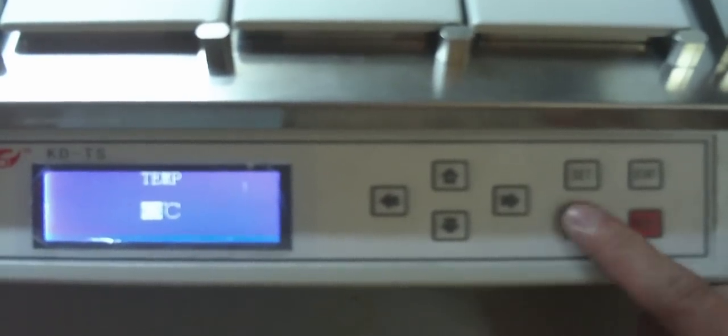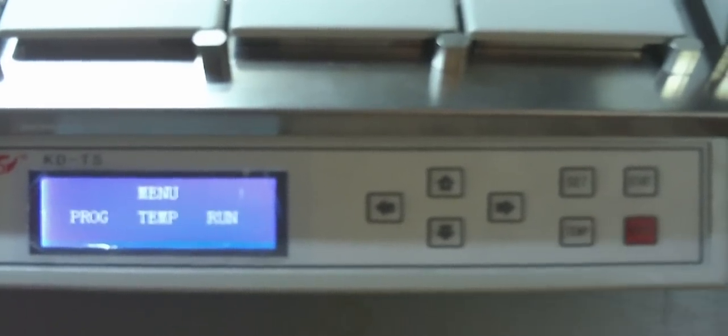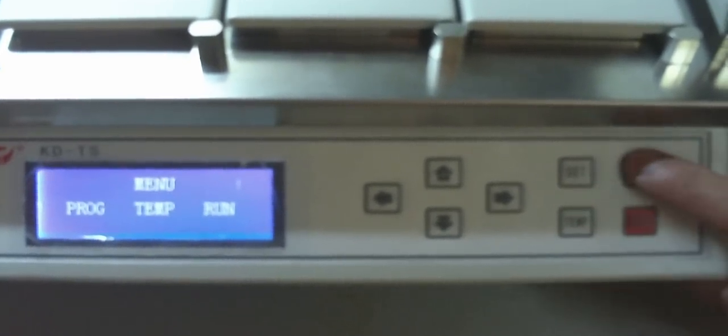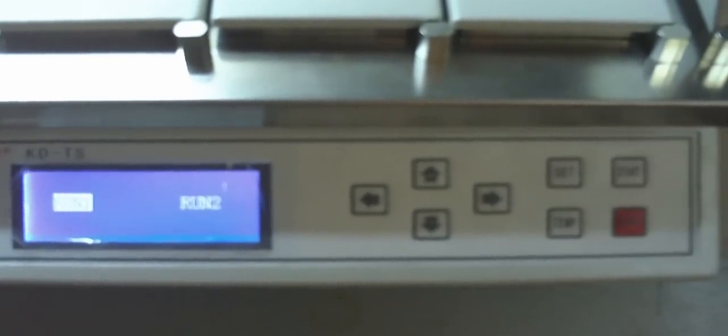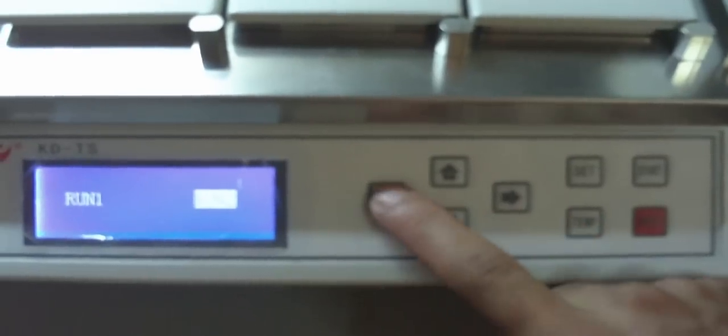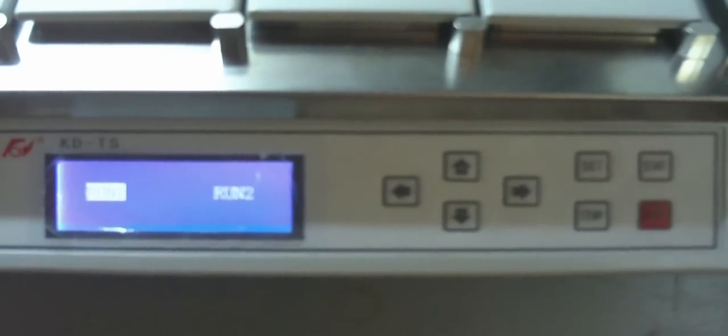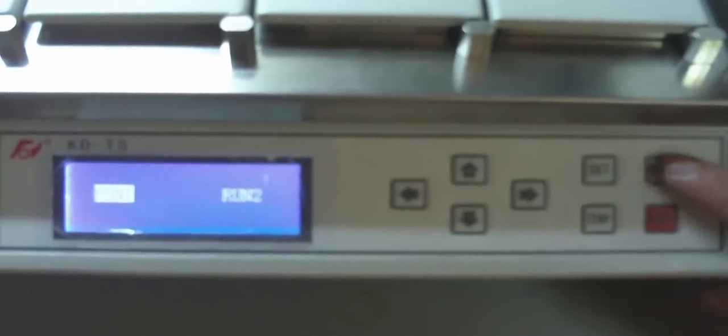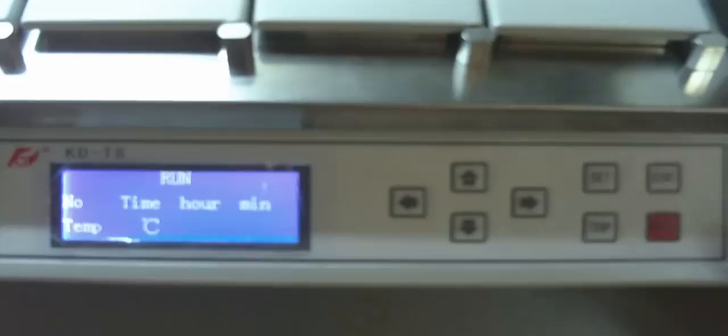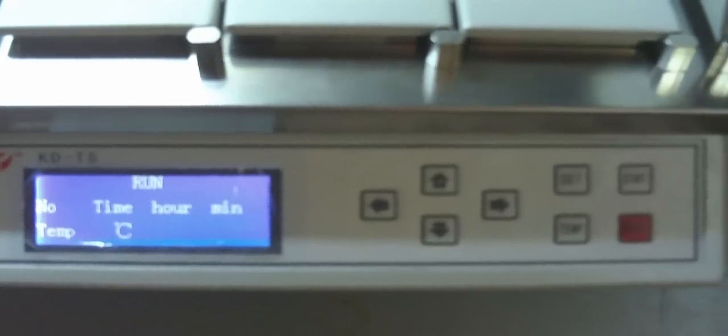After finishing settings, press the START key to enter the run interface. Choose to run Program 1 or 2 by pressing the left or right key. Press START key to confirm and begin running.